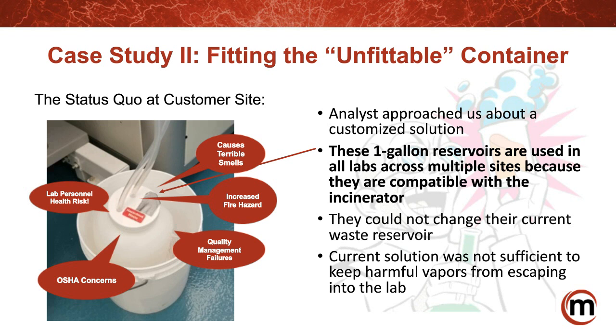This container was the only one that was compatible with their incinerator, and there were already way too many procedures in place to make a procedure change to a different container. And we didn't have an existing cap that we offered currently to fit right onto the container without popping off. So we had to talk with our manufacturers and come up with a customized solution.